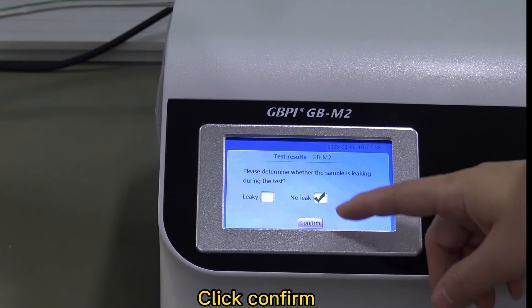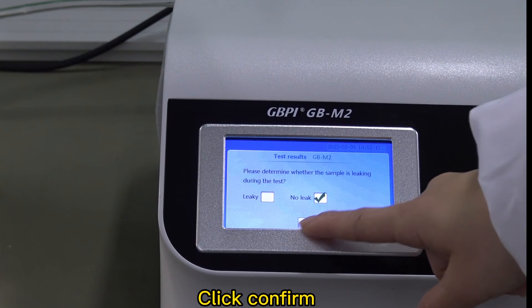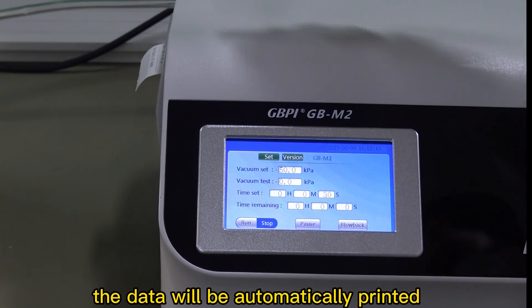Click confirm. The data will be automatically printed.